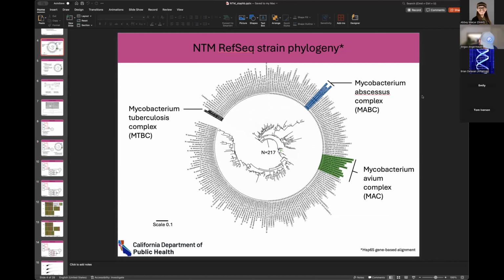And then I'm just going to ask a follow-up question. Do you guys have any plans? So I'm assuming you're talking about all these mixed strains. You're going directly from primary specimen, then, and not from clinical isolates that are growing back out? Yeah, again, that's not 100% my area of culturing these mycobacterium, but I think, yes, oftentimes it's sequencing off sediment to try to get an answer as fast as possible, and then following up with culturing, which I think happens a lot of the time. I don't really want to say that for sure. I don't know exactly, but that's what I've overheard.